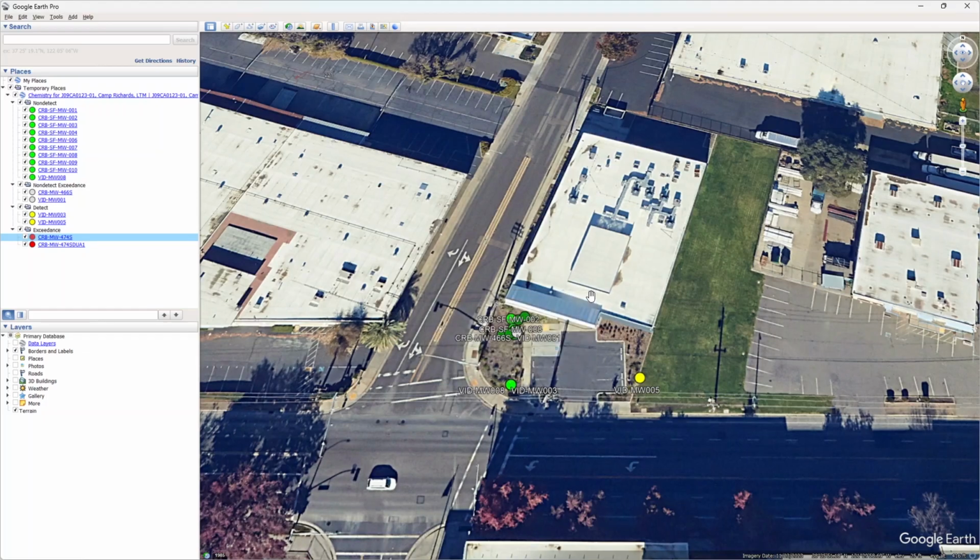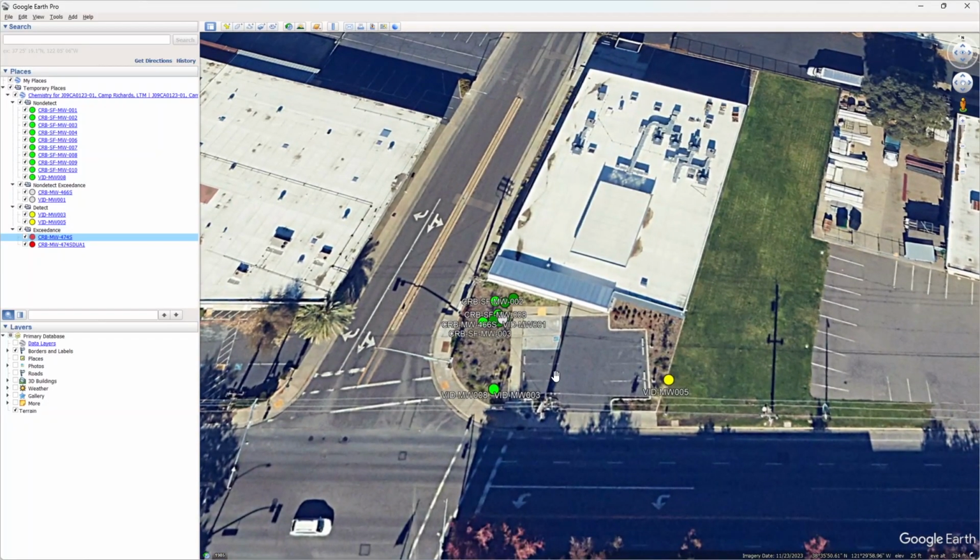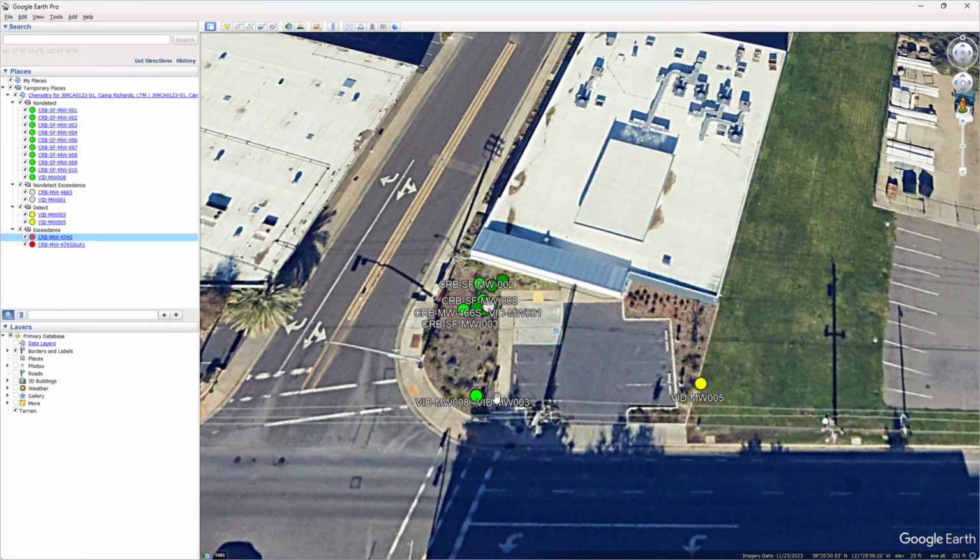Visualizing the data this way allows us to extrapolate for locations that were not sampled previously. For example, if we have a new location next to this red one, then we may determine that the sample collected from our new location will need to be diluted. The other way to pre-screen data is by using reports.